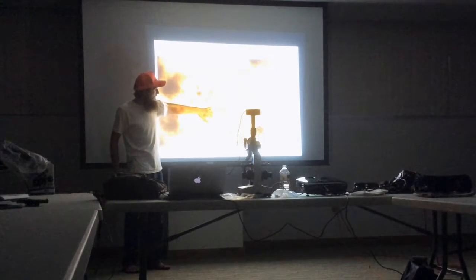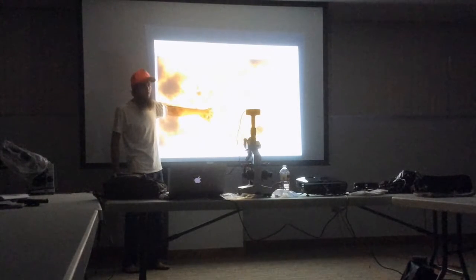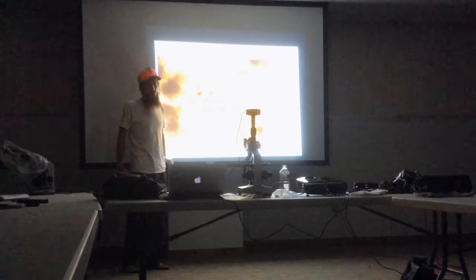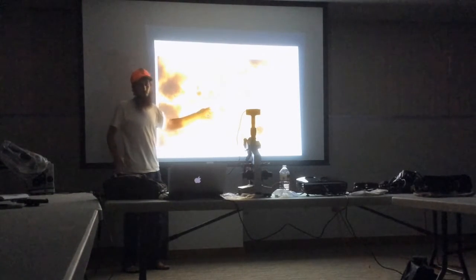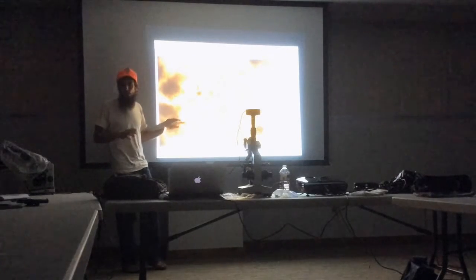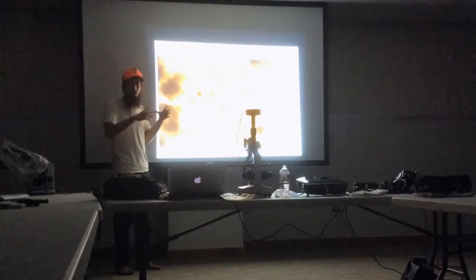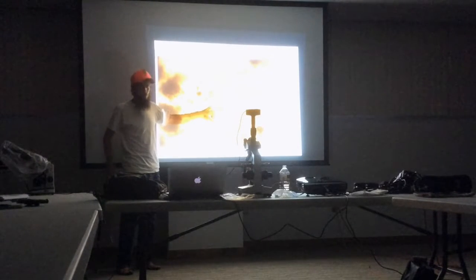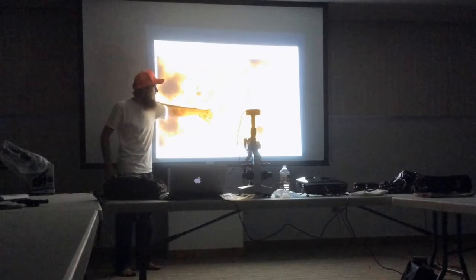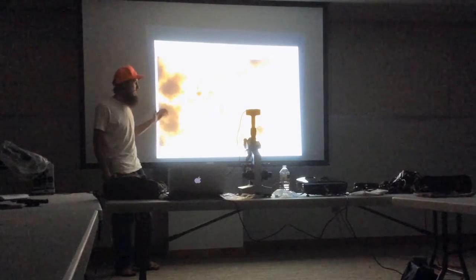Then there's this here, which is either an algae or a piece of pollen. Both algae and little diatom type of things look really fractally, and so do pieces of pollen that you'll see. So chunks of things like that in there are pollen or an algae, depending.